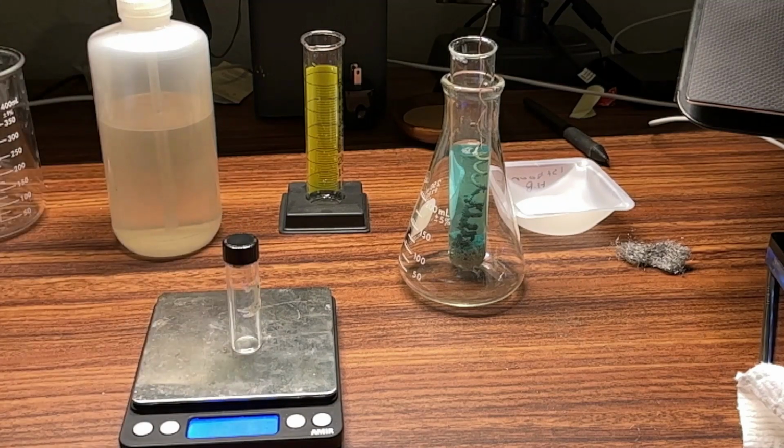we need to use the mass of the vial with the silver nitrate and the mass of the vial without the silver nitrate. We can subtract those two numbers to figure out how much silver nitrate we actually used in the reaction. You cannot read that probably, but it's 9.71 grams. So that's the mass of the empty vial with the lid, 9.71 grams.